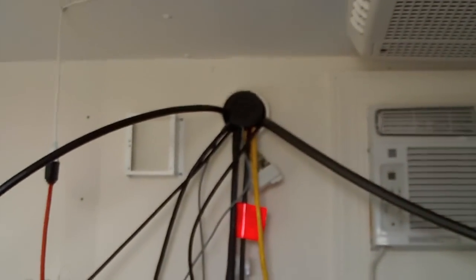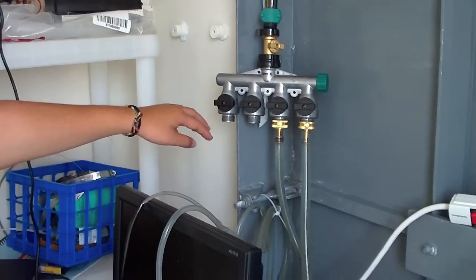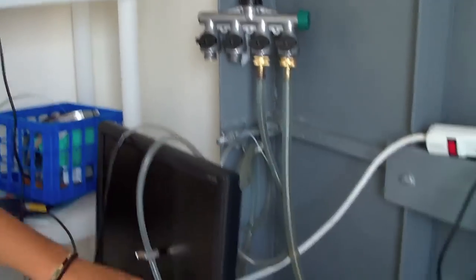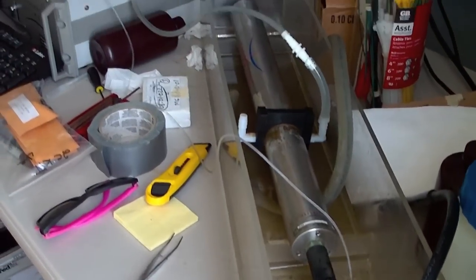So the pump pumps in water through this hole. Okay. It runs through the tube, and then it's split into two. Half of it goes into the SUNA, which measures nitrates. And why do you measure nitrates? We measure nitrates because it's an important nutrient for phytoplankton. Okay. And we want to see how healthy the phytoplankton are. So this is a good indicator.